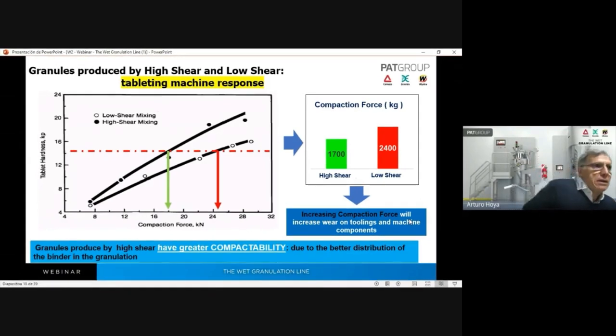In my opinion, we have to try with one of the approximations of scalability and develop an experimental design of the trial. In this case, we will obtain the best impeller speed.